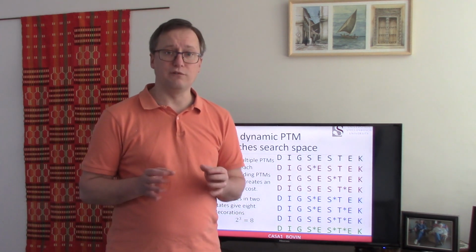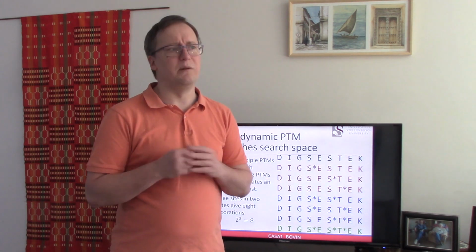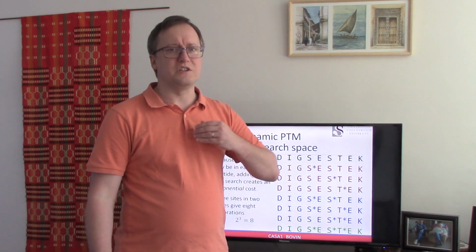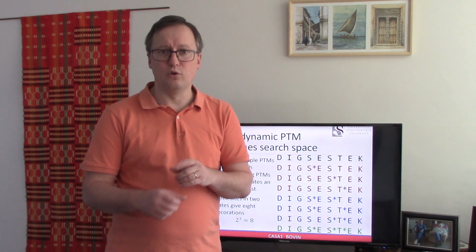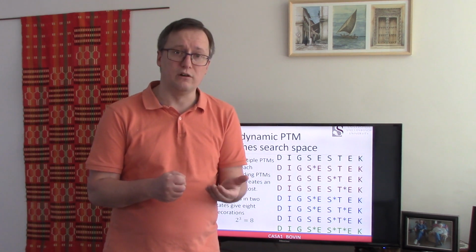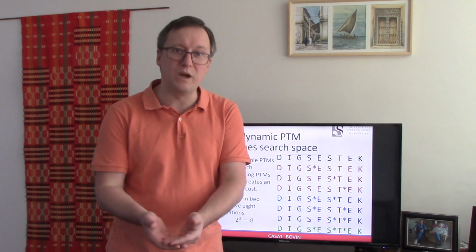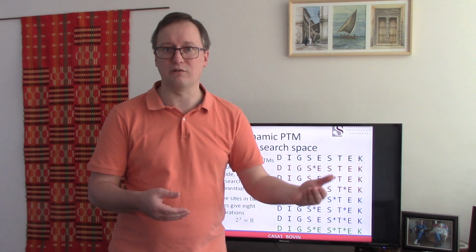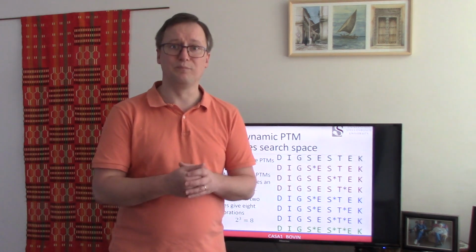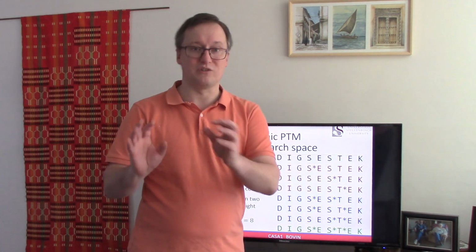Typically, when we go searching for phosphorylations, and certainly there are lots of phosphorylations in cow's milk, you could specify serine maybe at its normal mass of 87 Daltons, or it might be 80 mass units higher to reflect that it's a phosphoserine. Similarly, threonine could be 101 mass units, or it could be 181 mass units if it's bearing a phosphorylation, a phosphothreonine. There's also the case that tyrosine might be present, and that tyrosine might be in its ordinary mass, or it might be at 80 mass units higher.